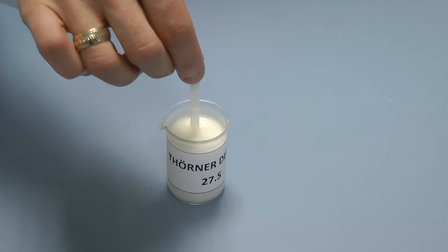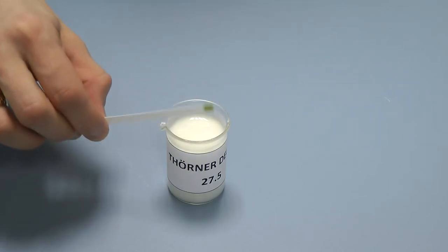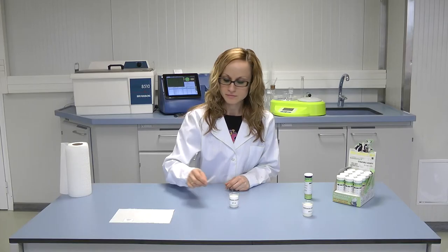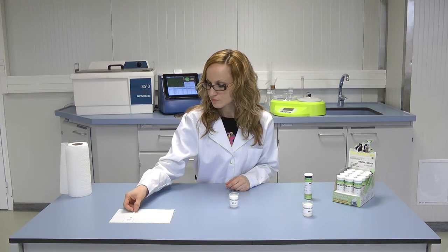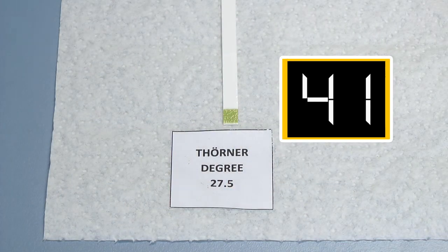After the test strip is taken out of the milk sample, completely remove all milk drops from it by tapping on the edge of the cup. Place the test strip on a paper towel for complete absorption of the milk residues. Wait 60 seconds.